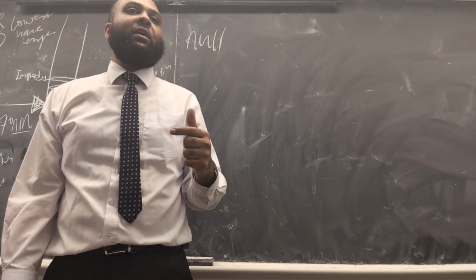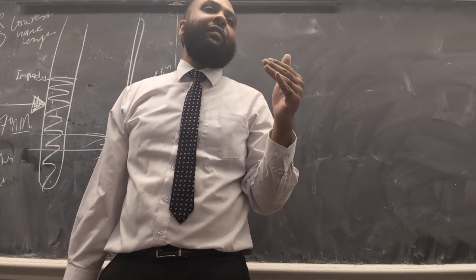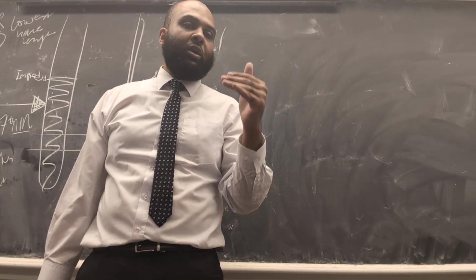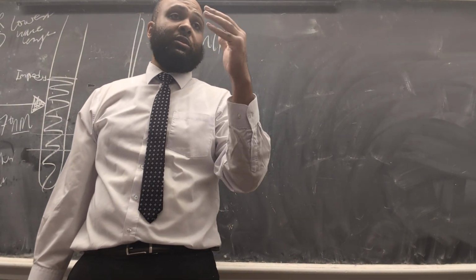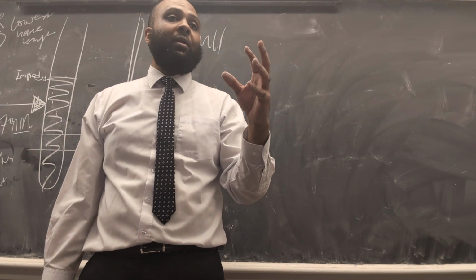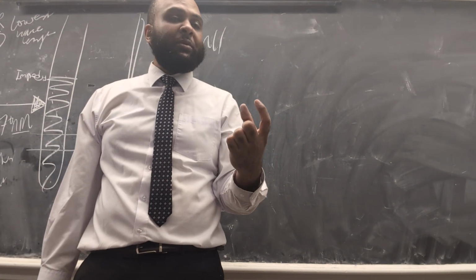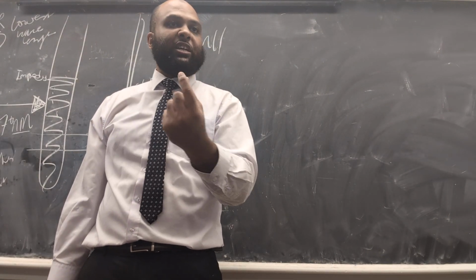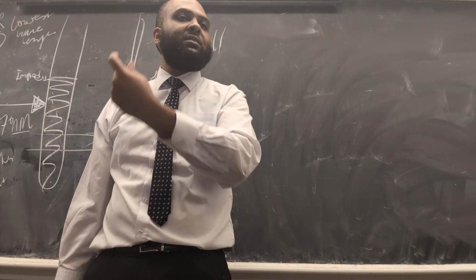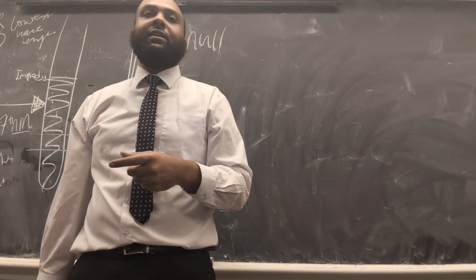But the alternative hypothesis would say we have an optimal pH 5. The more we deviate downward or upward, the capacity of our enzyme function will drop, and that will be proven by the less absorbance. If there's less absorbance, that means there's less concentration. Less concentration means there's less product. Less product means the enzyme is not working properly. So we're going to find that in the lab.